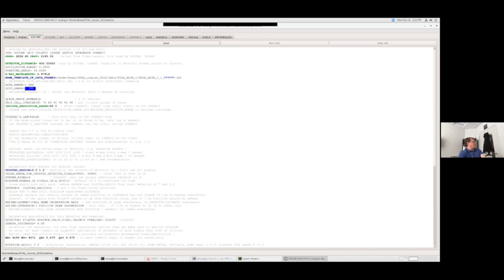Space group number is where you can define, if you know your space group, you can define that here. All the space groups are given a specific number according to the international tables of symmetry used for crystallography. Unit cell constants would be the unit cell constants of your crystal. If you give it a space group number of 0, XDS assumes that it's unknown and then will try to predict what it is and give you a guess. We'll see that later.